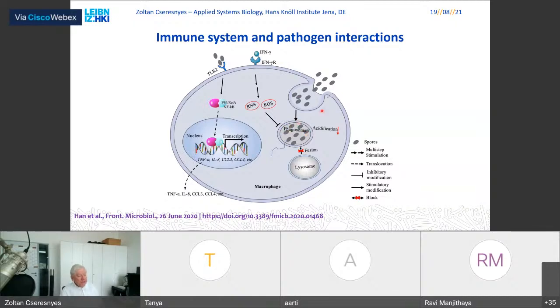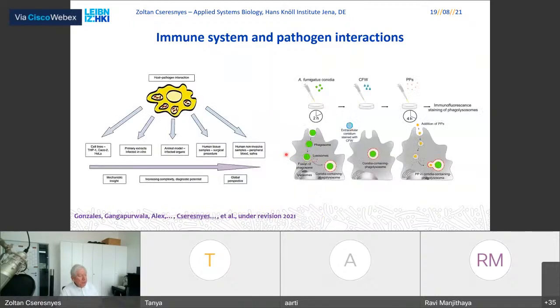So our goal is to characterize how good these macrophages, the various types of macrophages, are at handling the task of phagocytosing the pathogens, in this case fungi or fungal spores, little conidia, by taking them up and then digesting them in this highly acidic environment.